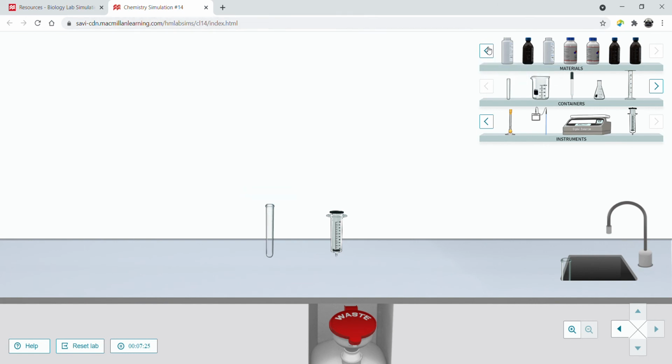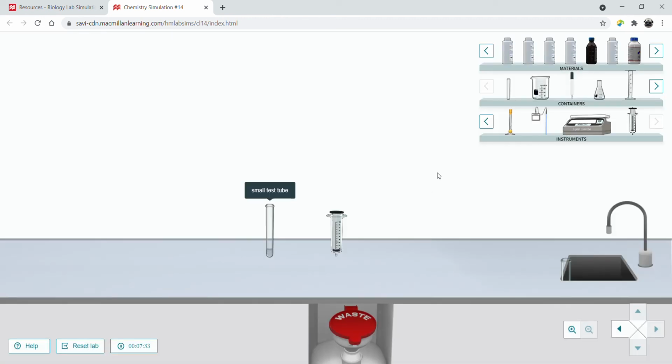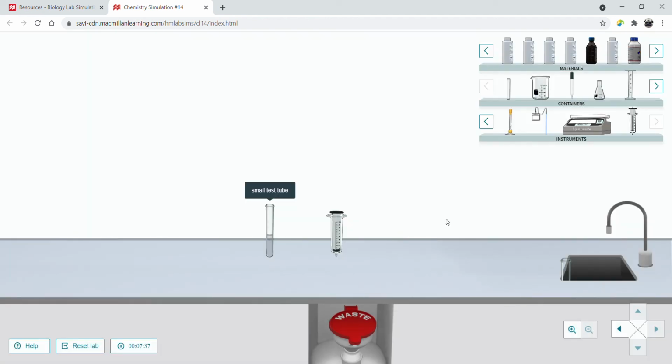All right. Let's do this in order. There's our peroxide. I'm going to add 5 mLs of peroxide. Now we're going to test the environment that we're changing. The independent variable is the pH, right? The dependent variable is the amount of oxygen. Oh, shoot, I put in too much. Sorry, let's try that again. Let's get out a new test tube. That was my fault.